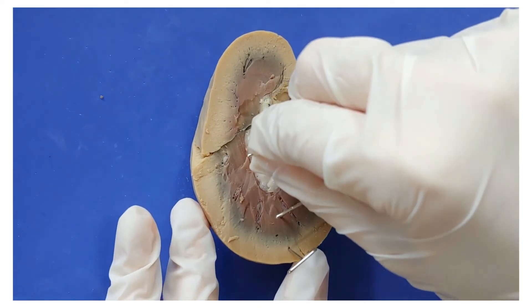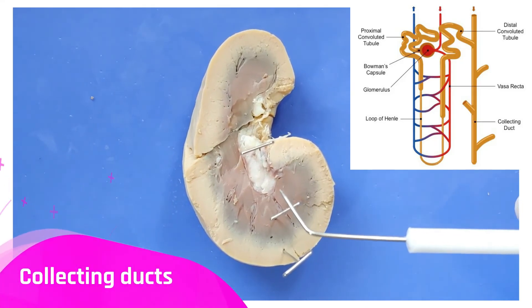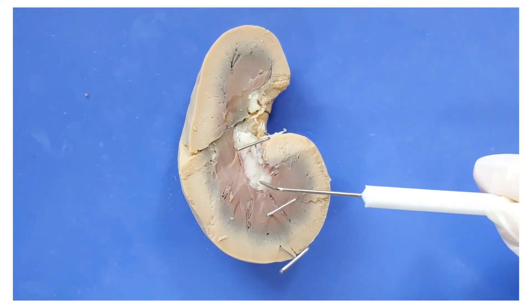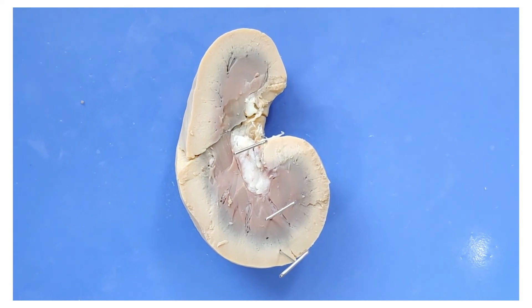I'll put a pin here. After going through the loop of Henle, the filtrate passes through a structure called the collecting duct, which then all drains into the pelvis. The renal pelvis is a hollow structure — it's basically a funnel for all the collecting ducts. From there, the urine passes out through the ureter to the urinary bladder.